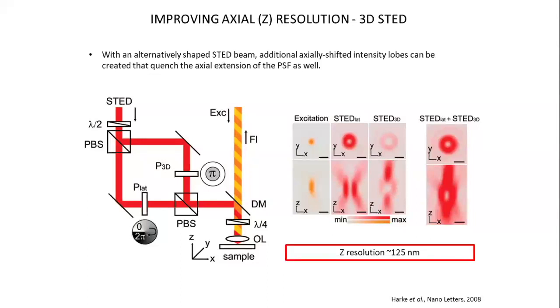So here we're really squeezing the slice of the image, the focal depth of the microscope. We talked about the confocal microscope last week was producing a depth resolved slice. This thing here basically squeezes that slice down even more.